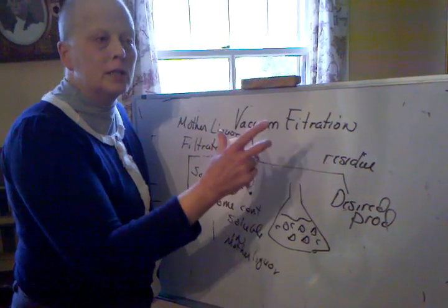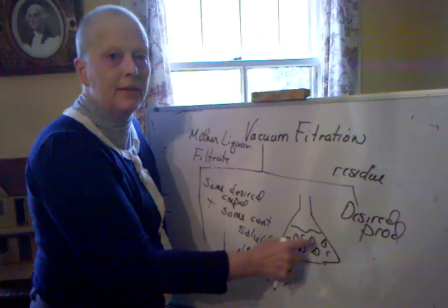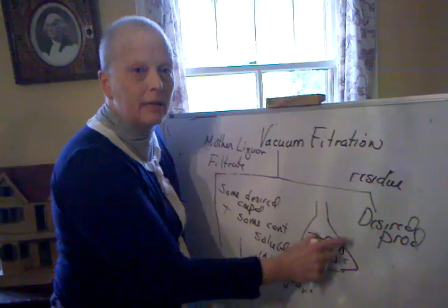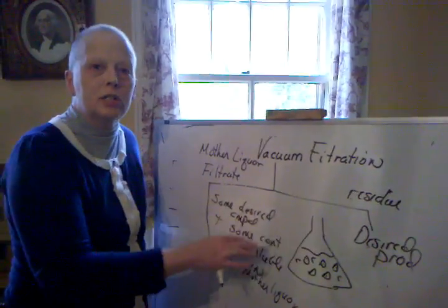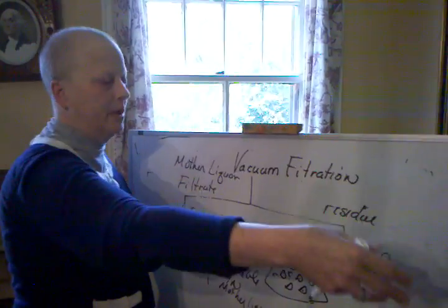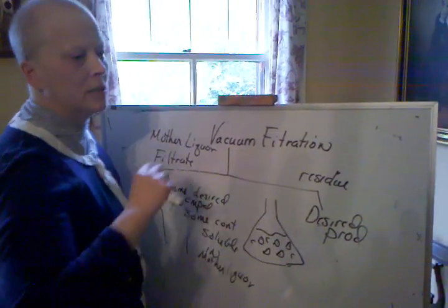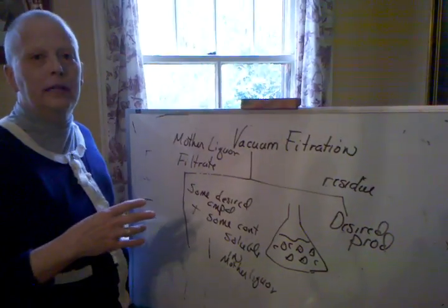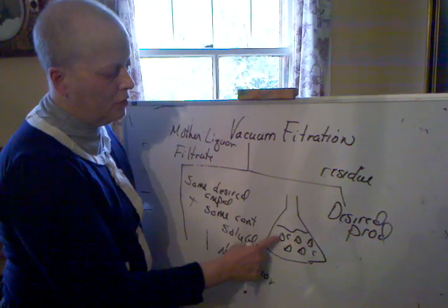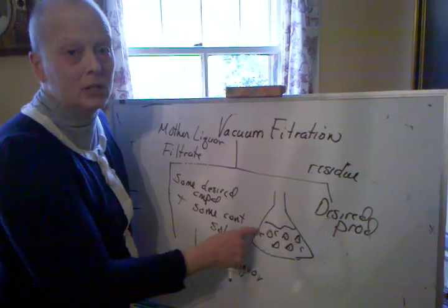So what will happen is when the solution gets to a certain temperature, the desired molecules will no longer be solvated well enough, they won't have enough energy to stay in solution, and the desired molecules will start aggregating together. And if this process occurs slowly enough, the crystals will form with very, very slow equilibrium, and if a contaminant gets trapped in the desired molecule, it'll spit out the contaminant and take a desired molecule in, simply because the desired molecule fits better into the crystal. And you'll form these beautiful D crystals, hopefully leaving these C contaminants in solution.